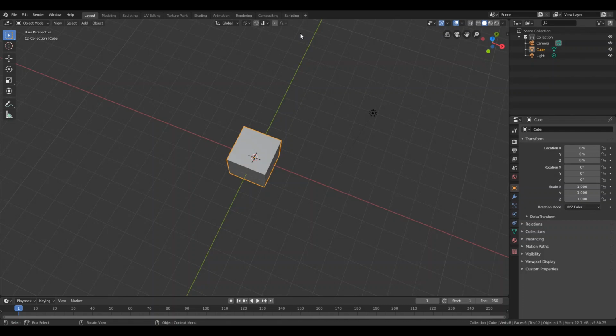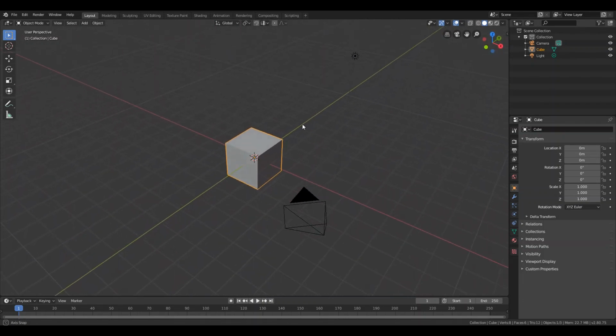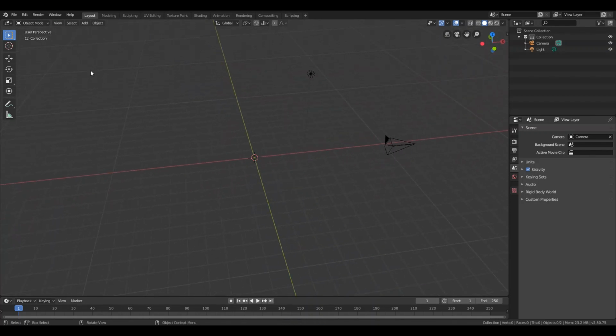Let's see. I didn't find my wireless mouse, so here's a wired mouse. So I'm gonna talk about scanning electron microscopes, and why not talk about it in Blender? And later GIMP, and then later Blender again. So let's see. Delete this part. So I think I will talk about it through the stages of where the electron beam goes.